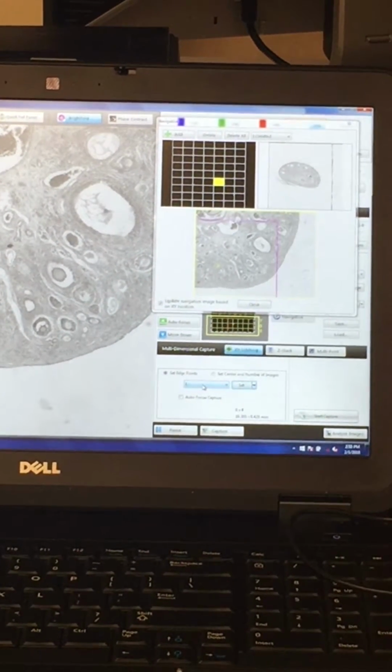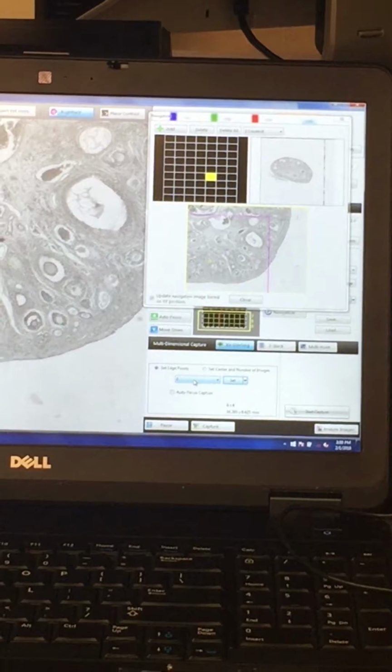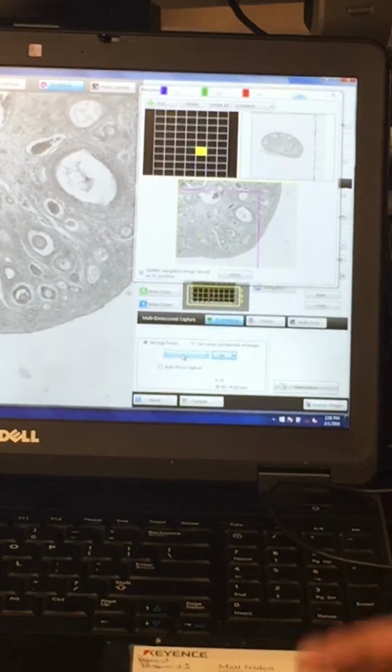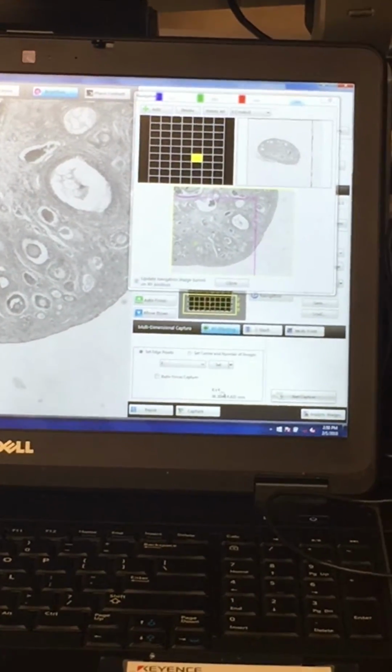And I only set 4 points of focus, my A, B, C, and D, to capture it. But you can set up to actually 10 points of focus. So if you're at a higher magnification and the sample's not flat, I would definitely recommend taking advantage of all 10 of those points. Just find 6 arbitrary points in the middle of the sample. But once you got it all, it tells you here, it's going to take about 24 images.